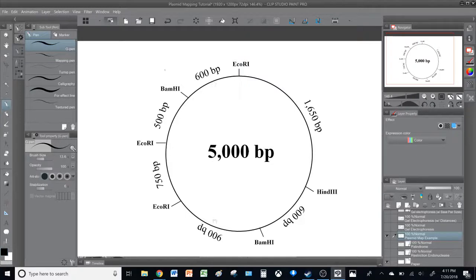And after drawing the circular DNA, you simply highlight the locations at which the enzymes digest the DNA strand, while pinpointing out the difference in base pairs between each cutout point. Before we start on how we actually determine where each enzyme cuts, restriction endonucleases are named after the bacteria from which they are derived.